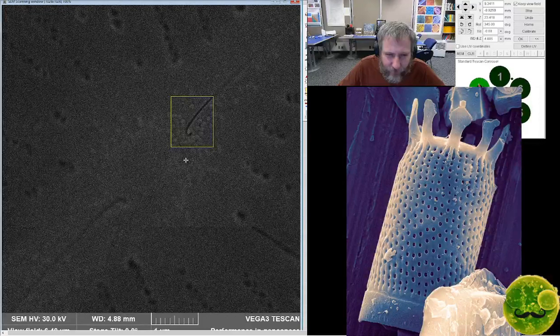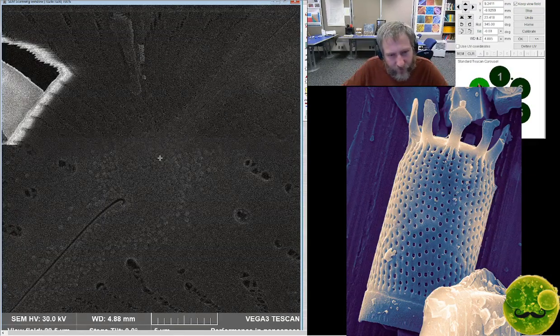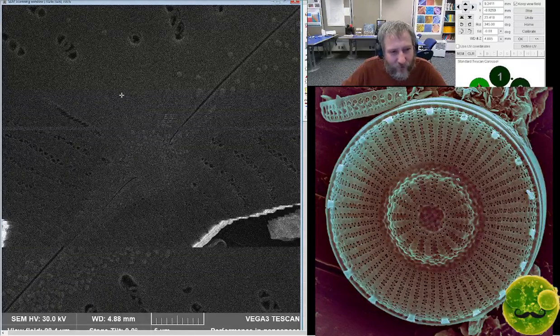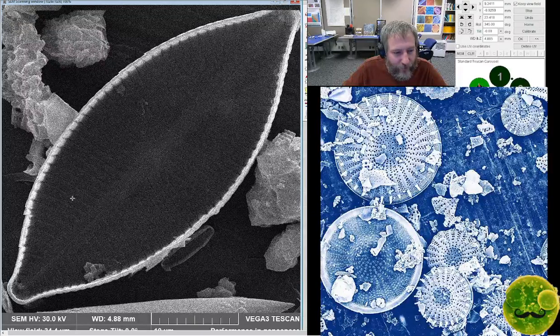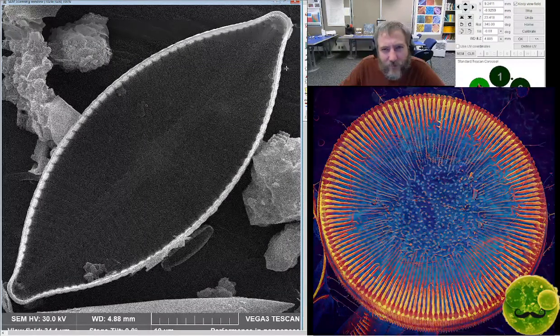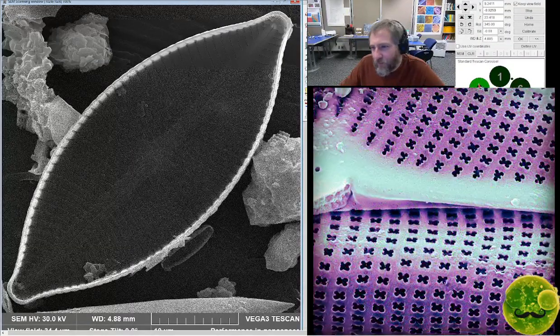Rotating it takes it a little out of focus, so I'm just gonna come back and tighten that. Very cool looking central area. Is there like isolated striae? There's a bunch of like weird little stigma-like structures almost. There are so many weird periplecones in Malawi and Tanganyika, and I'm sure everybody's got the names wrong on these things. They at least got them in the wrong genus. Look at that. Cool. Alright, let's take a picture.